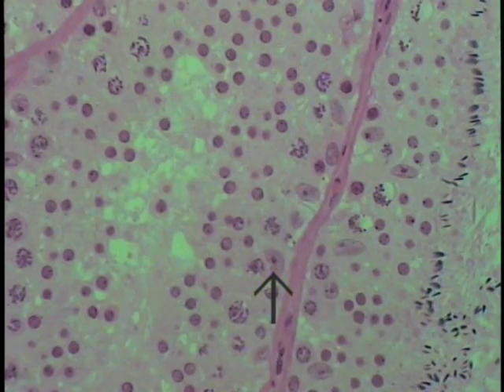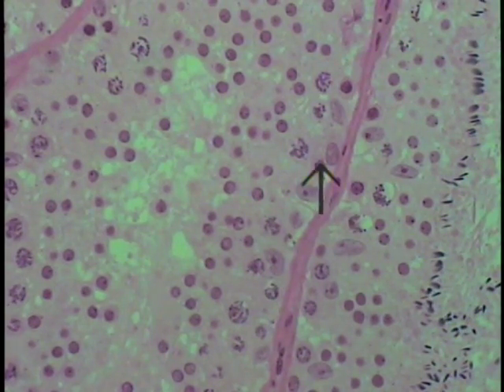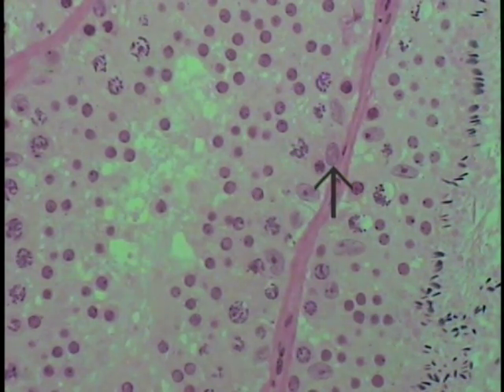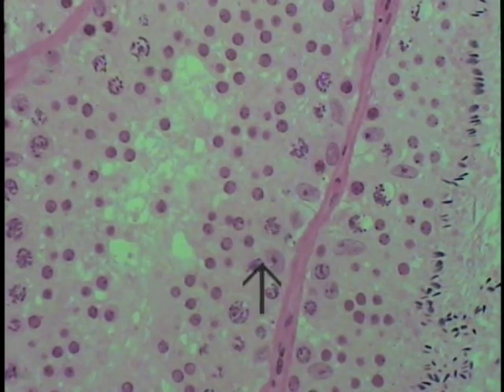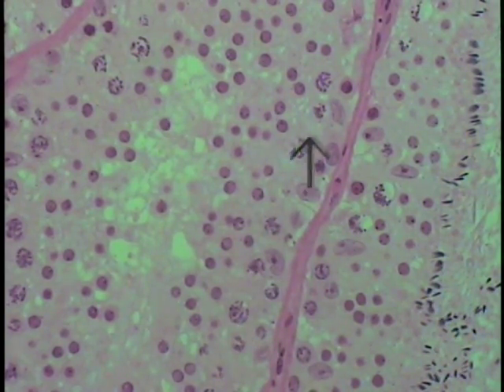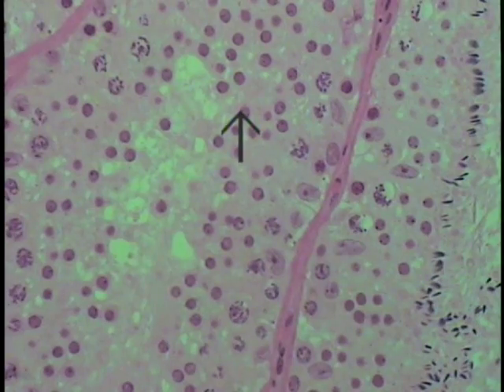This particular tubule looks quite different because different cell associations are in evidence. The Sertoli cell is defined by its nucleus. The primary dividing spermatocytes are visible, and these small round nucleated cells are all early spermatids.